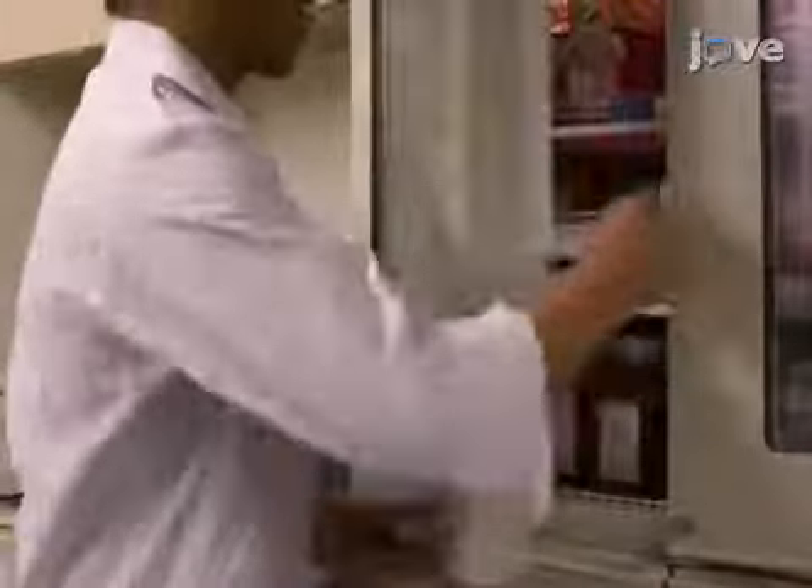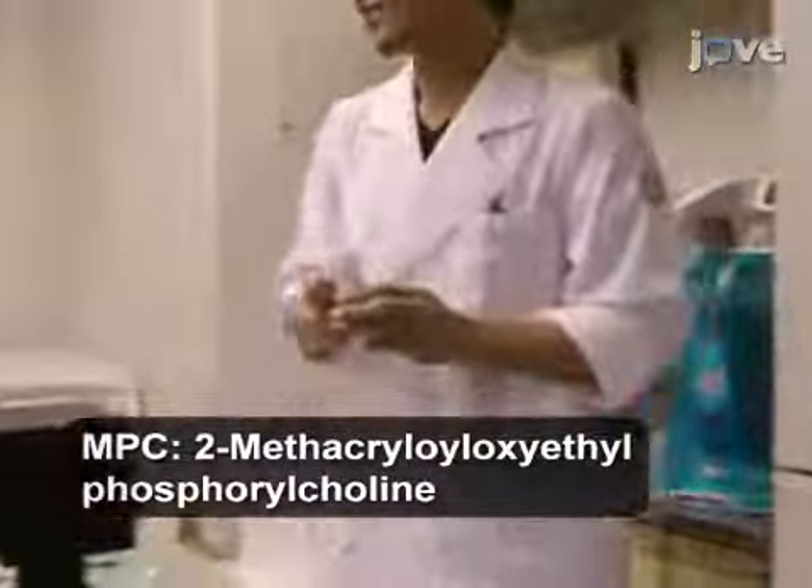To begin the experiment, obtain the previously synthesized PMBPA-Z polymer.